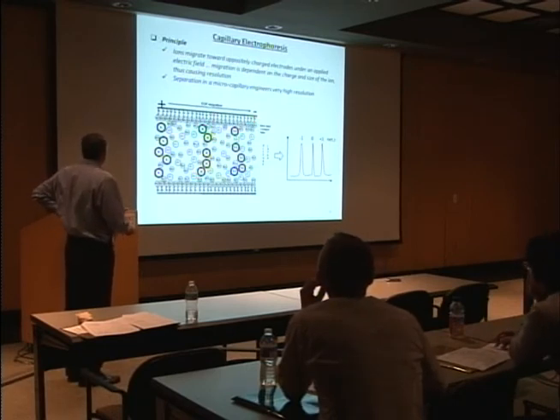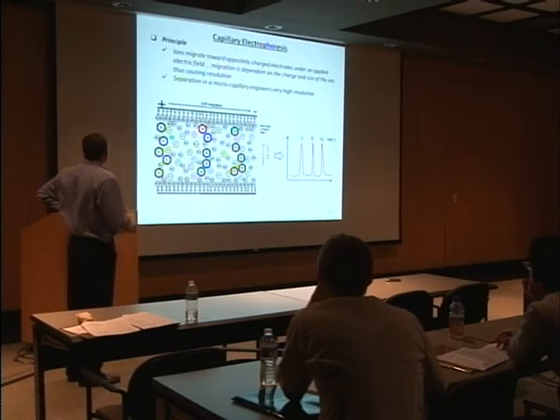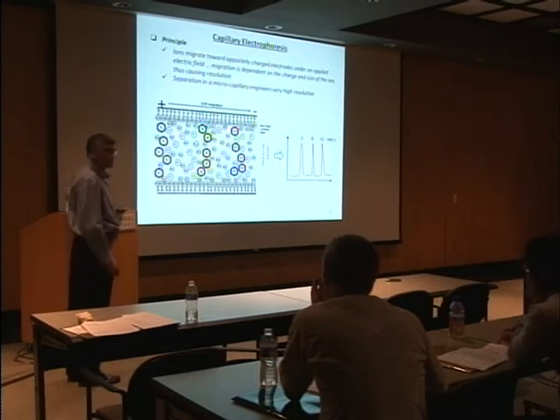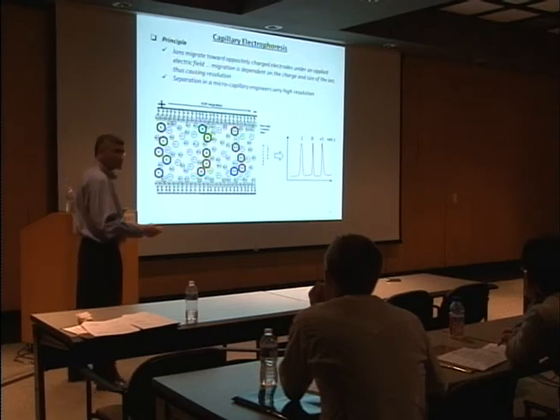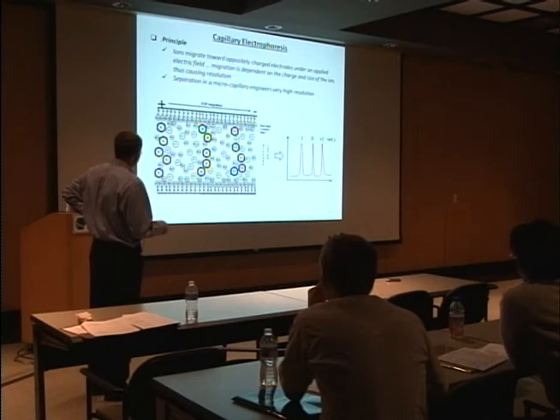In capillary electrophoresis we have the wall, typically silica or quartz, and at most pHs, let's say higher than pH 3, the silanol groups are typically ionized, and because of that the sodium present in the buffer binds and forms essentially an immovable layer on both walls. So there is a strong positively charged layer on both sides, and the buffer keeps flowing.